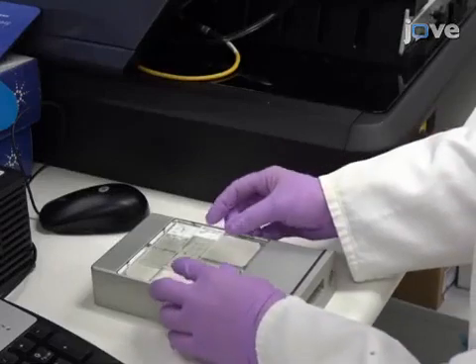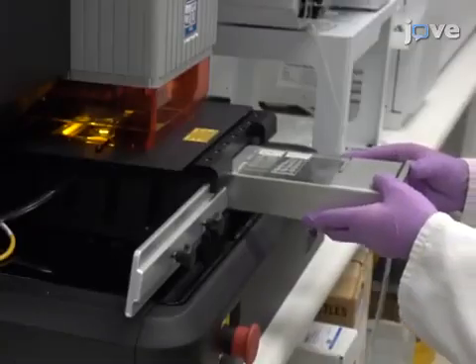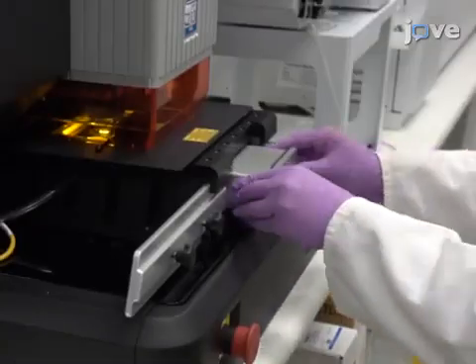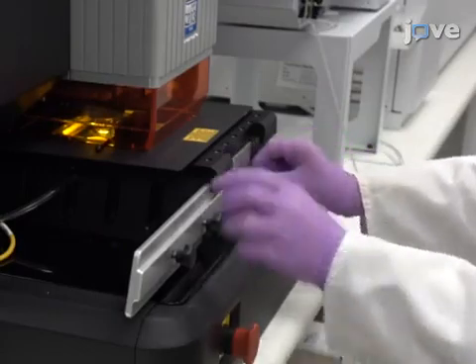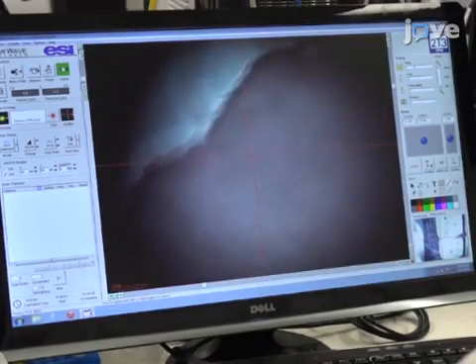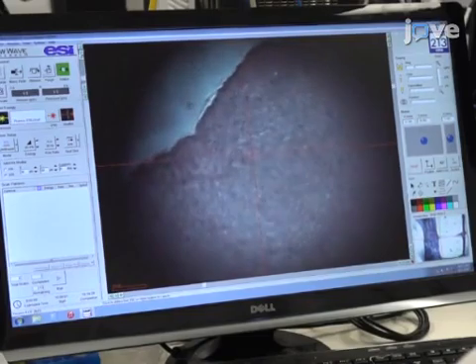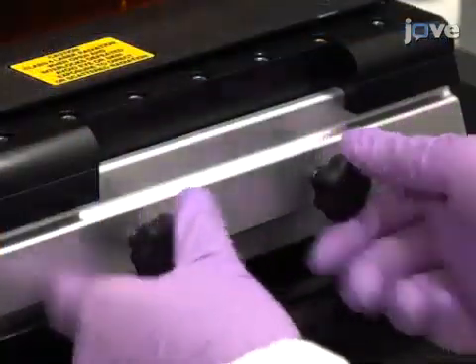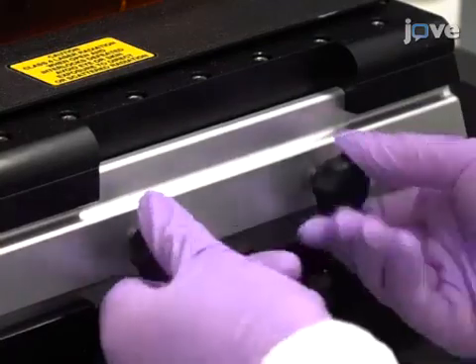First, place a brain tissue sample and all matrix matched tissue standards in the laser ablation chamber. Ensure that the samples are within the LA-ICP-MS camera depth of field. Close the chamber door and finger tighten the screws.